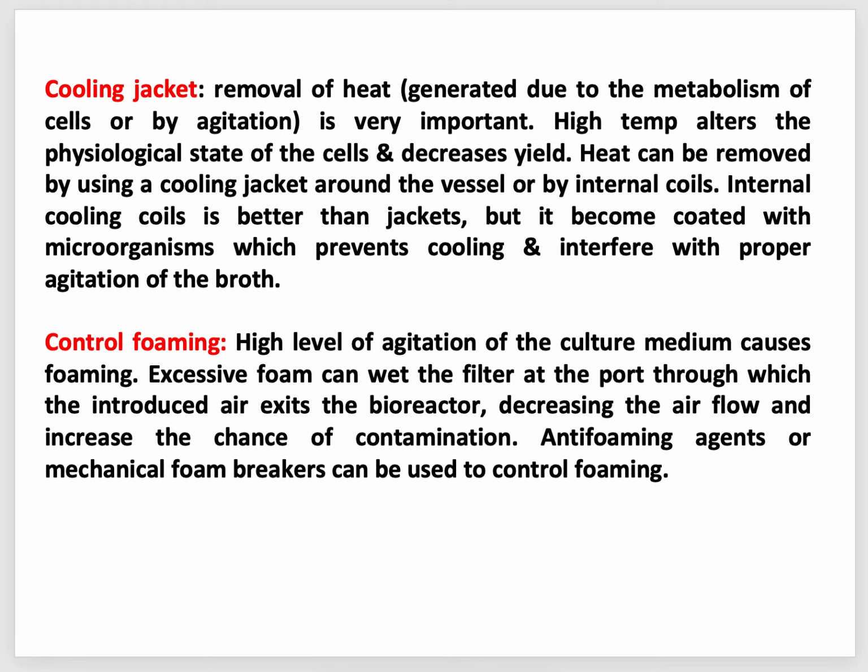It will produce lots of heat, and high temperature affects the cells. They affect the physiological state of the cells, and if the physiological state of the cells is affected, yield will be decreased. We will get less product. So it's important that we control the heat of the bioreactor. We have to keep the temperature of the bioreactor within the range. So to do that, we need to use some kind of cooling system.